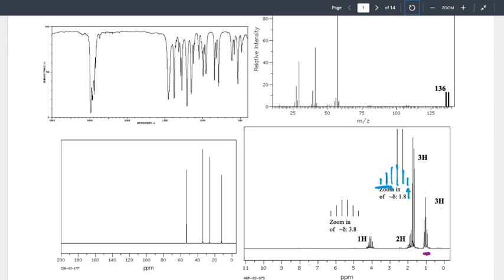Okay, so now we could go back up to either the blue or the red. Doobie, you said blue, so let's take a look at the blue. The blue has a CH3. So the blue could be duplicated with one of those pieces. That CH3 is connected to a CH2. Do I have a CH3 connected to a CH2? Yeah, so the blue could be duplicating with the purple, but the blue has an extra piece saying I have a CH. So what do I need to do? I need to add that CH.